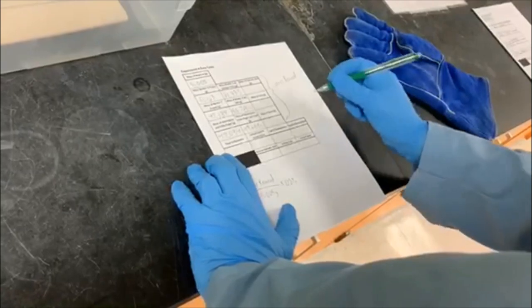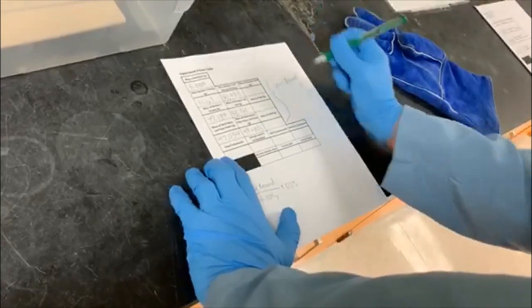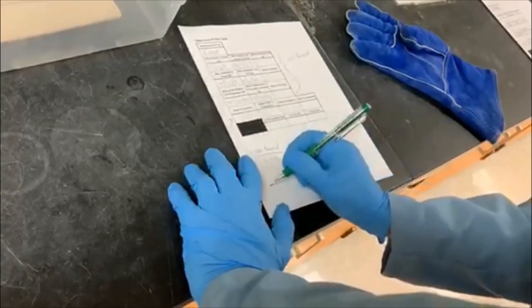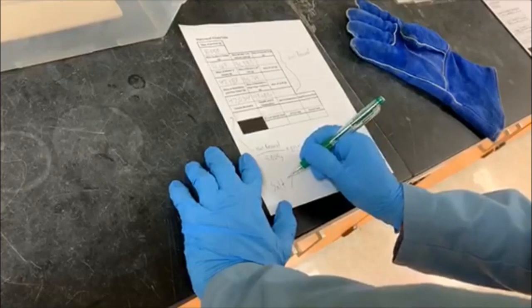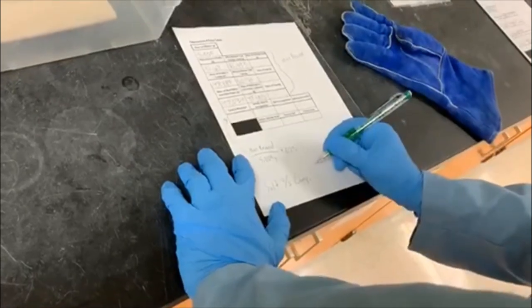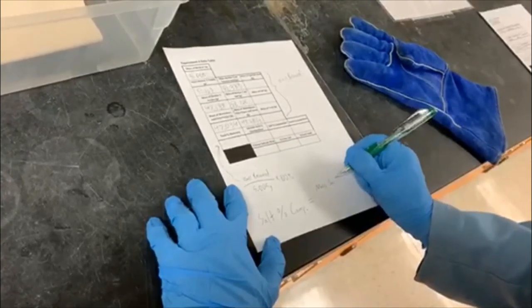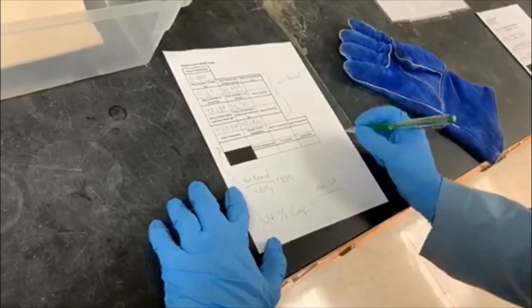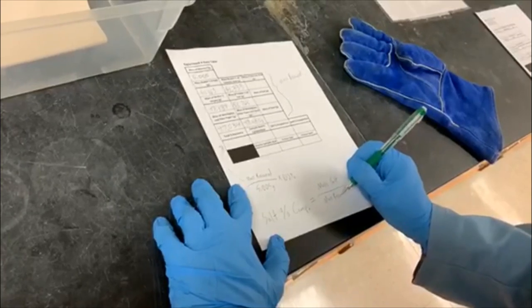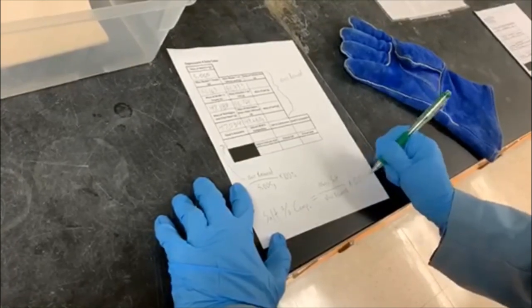And then for all of these, you'll basically take the mass of each of these. So for example, let's do salt. So salt percent composition would be mass of salt divided by mass recovered, times 100%.